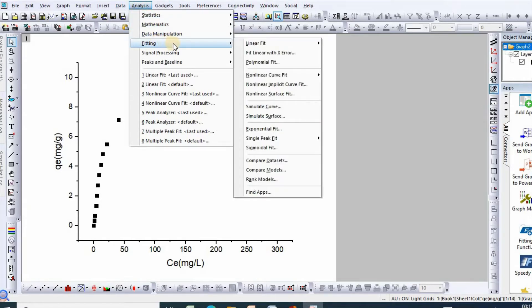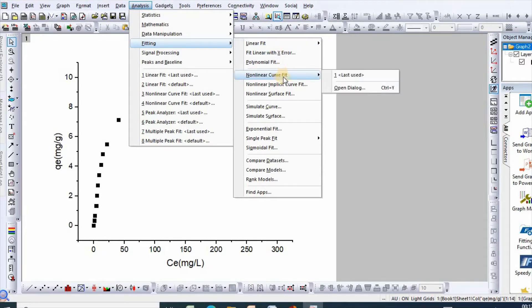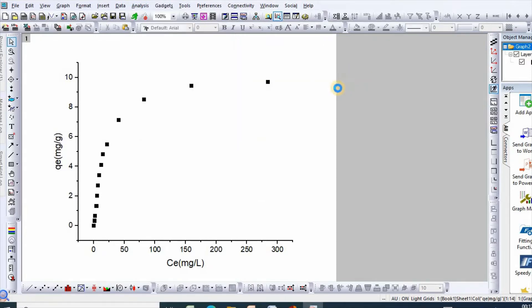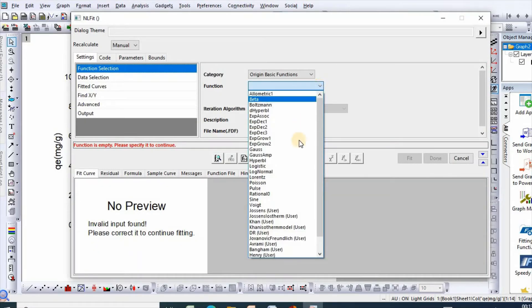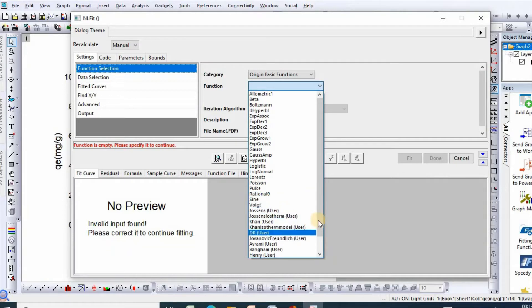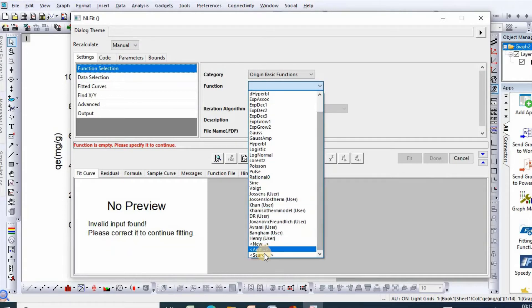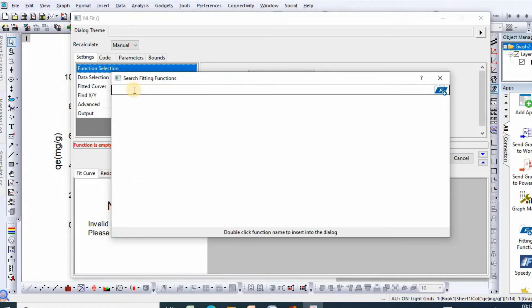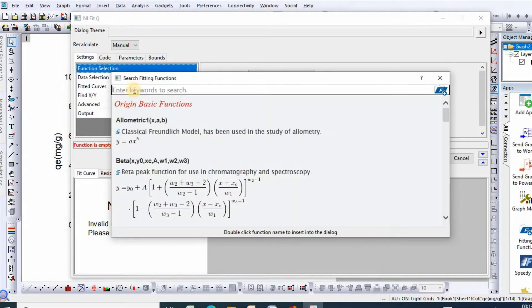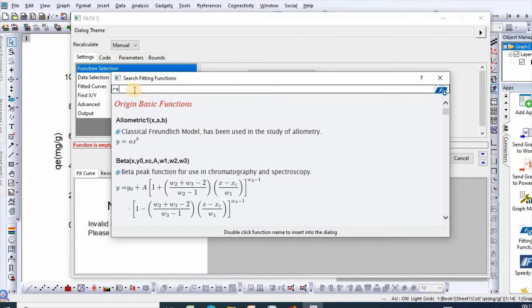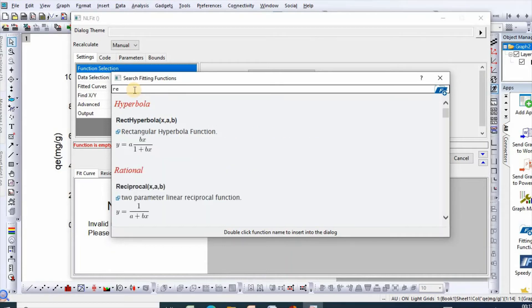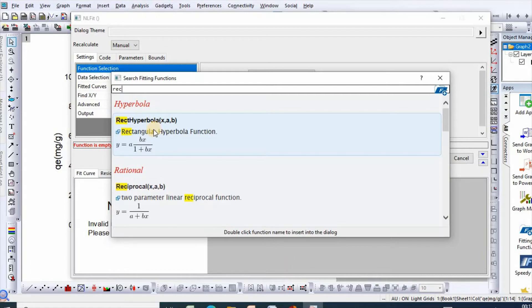Then Fitting, then Nonlinear Curve Fit, then Open Dialog, then go to Function, then Search. In my previous video I showed that rectangular hyperbola is equivalent to nonlinear Langmuir isotherm model, so let us search for rect. Here it is, rectangular hyperbola. Double click on it.